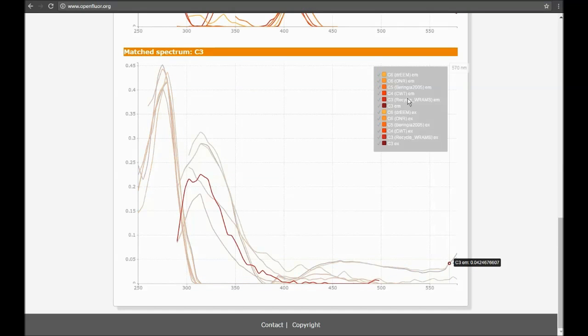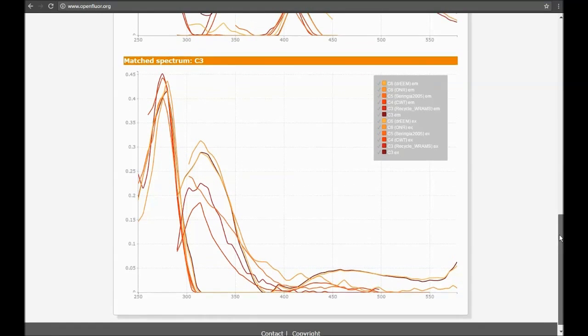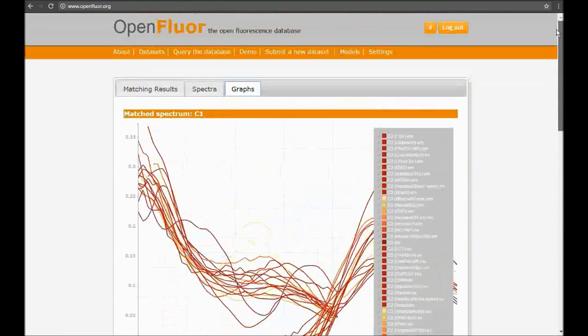In this way, you can already screen a little bit on which matches might be good and which matches might be not so good, and you should be careful to make any kind of assumption on the similarity. Now, this brings up an obvious question. So what does this database bring up with regards to similarity? So what's the threshold, and how can you set this threshold?